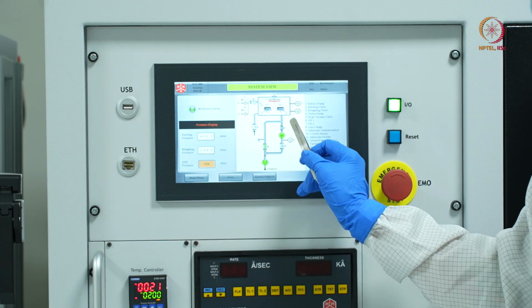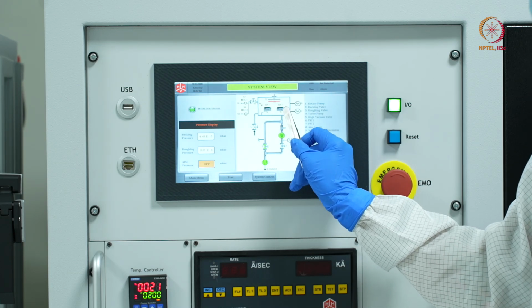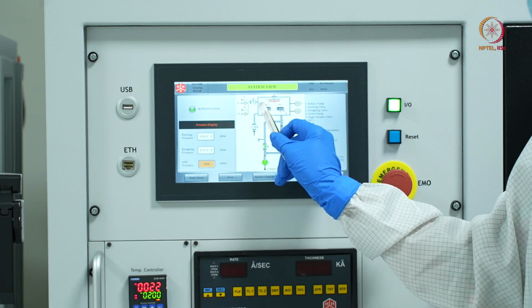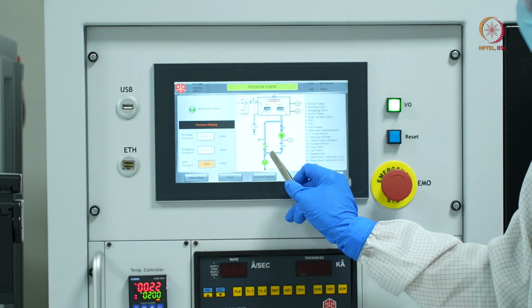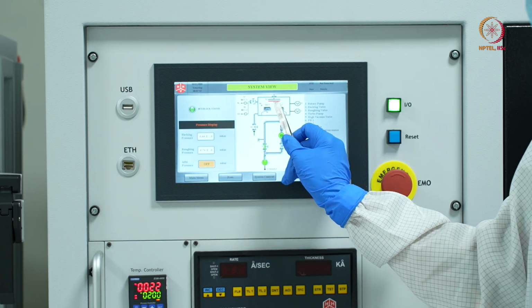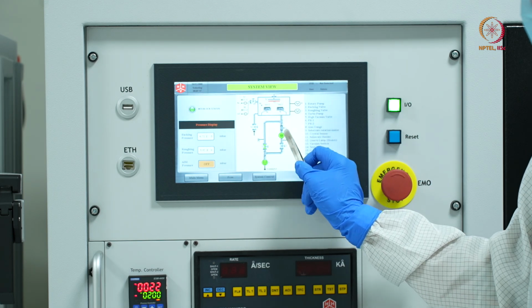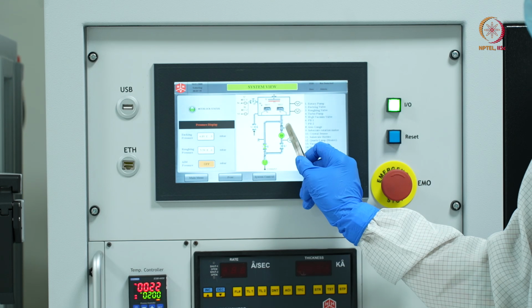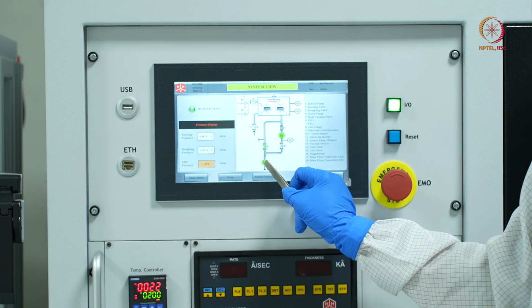Once I press cycle, the air inside the chamber will be sucked out through this line using the rotary pump first. Once the chamber pressure reaches 10 to the power minus 3 millibar, the high vacuum valve will open, and the evacuation will happen through this line.